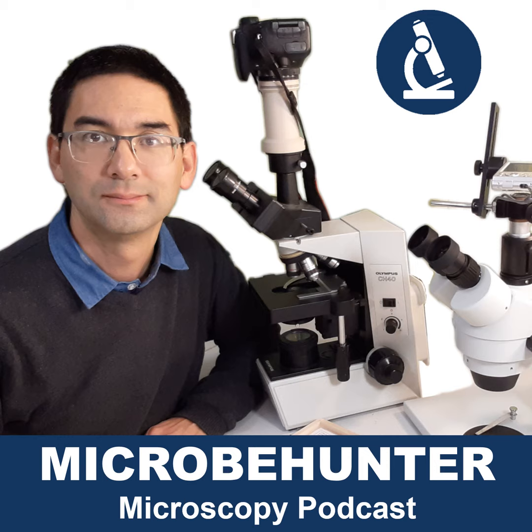If you look into the far distance using binoculars, then you also have a three-dimensional impression. A stereo microscope also does that. It gives you a stereoscopic sense of depth, which is quite fascinating. But I cannot put this paper clip under a compound microscope, because it doesn't allow any light to go through.